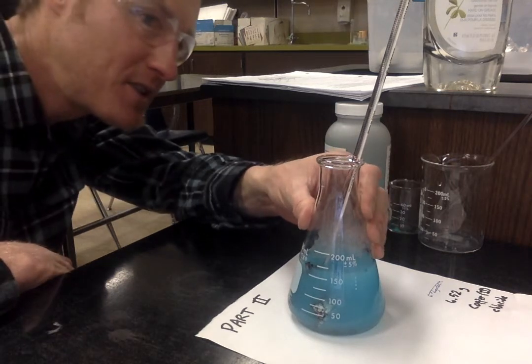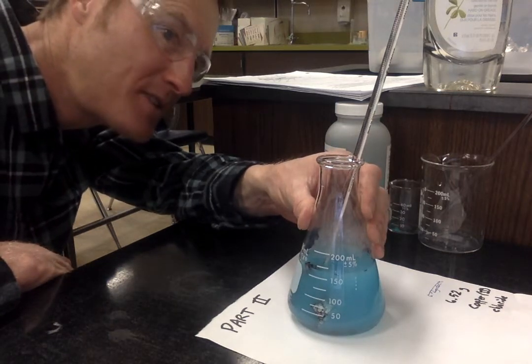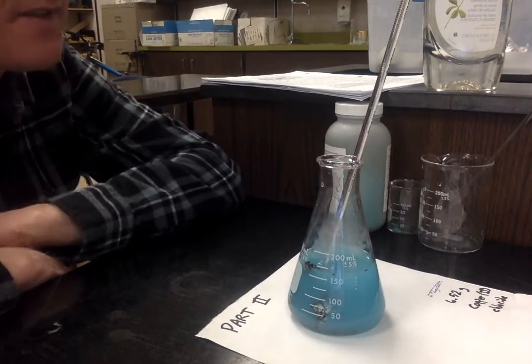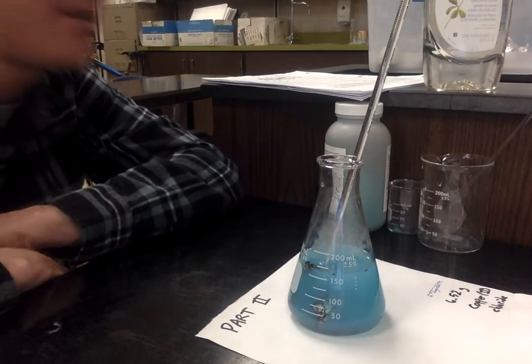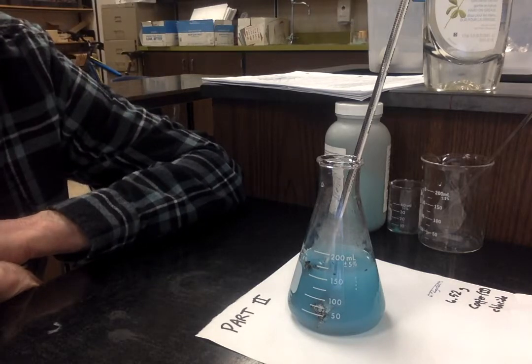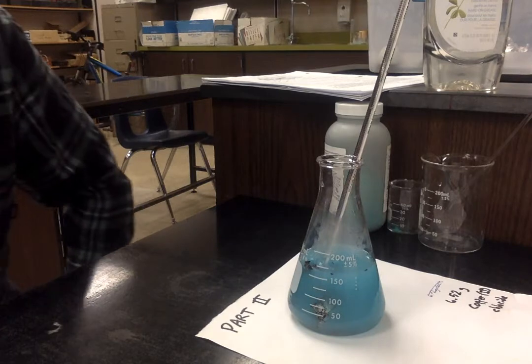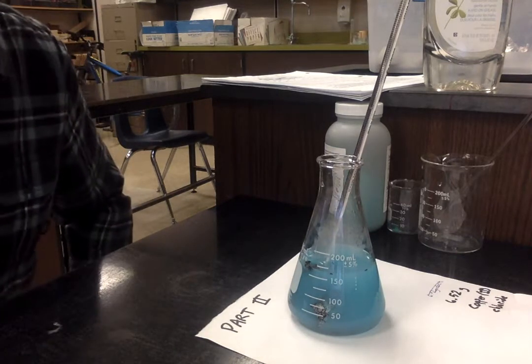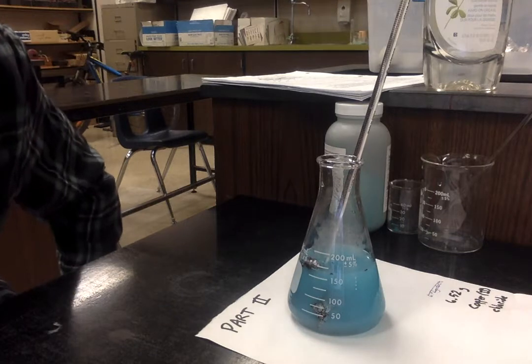The temperature of this solution has now gone up to 27.5, and it's increasing fairly quickly. You can actually see the thermometer edging up. By the way, you might remember I talked about the gas accumulating.